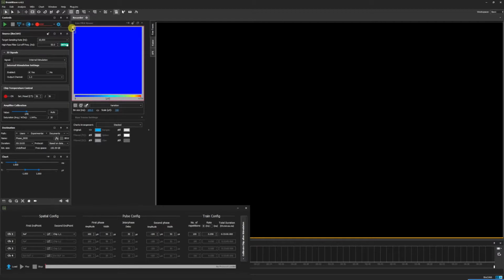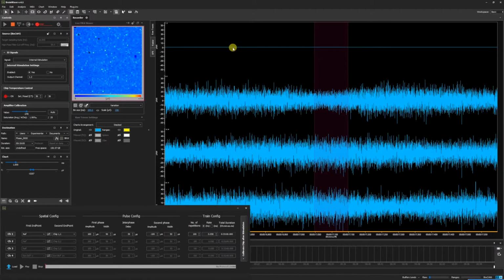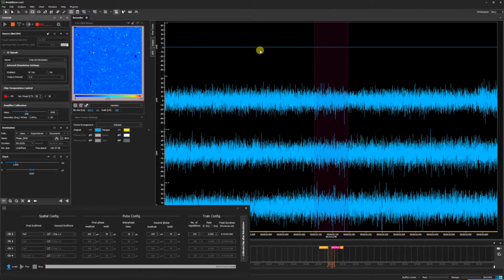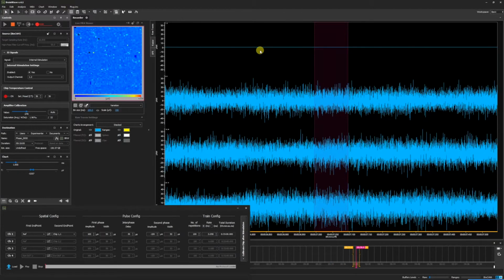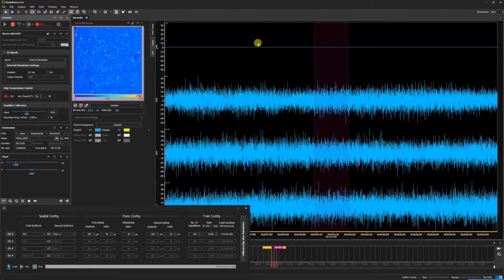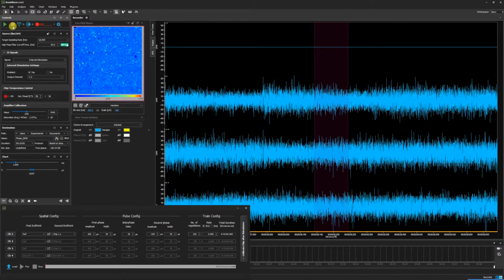Now in the MEA viewer, if we select channel 1, 2, and several other channels, using the Control, Shift, and click option, and clicking play, we can see that channel 1 has a value of 0. This is because with our internal stimulation settings, channel 1, 2 has been overridden to display only when a stimulation is introduced. As we have not yet loaded and played a basic stimulation, this value is currently 0. Meanwhile, our other channels are showing data as usual.